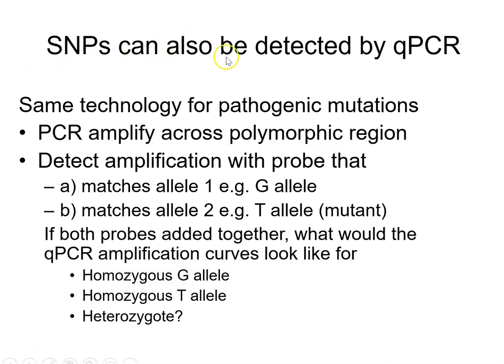What we can also do is assay for single nucleotide polymorphism changes using the principles of quantitative PCR.